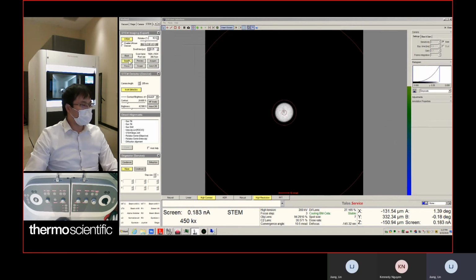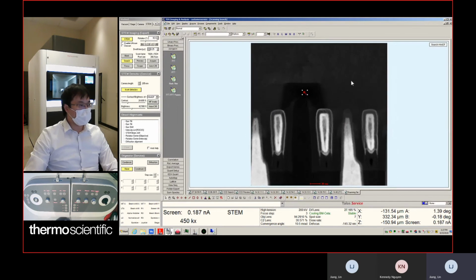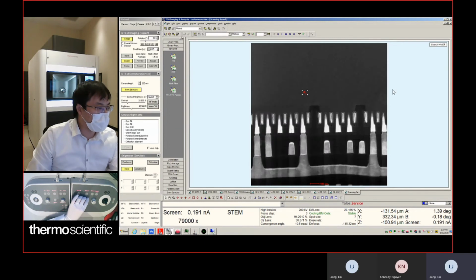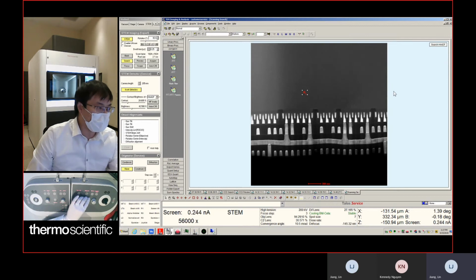You can do search, and we choose the image software here, and then we can zoom out or zoom in. So this is how, if you feel the quality is good, it's quite clear, then we can take the image. Before we take the image, we can adjust the contrast of the image a little bit.